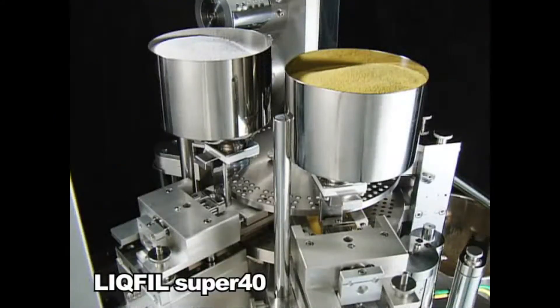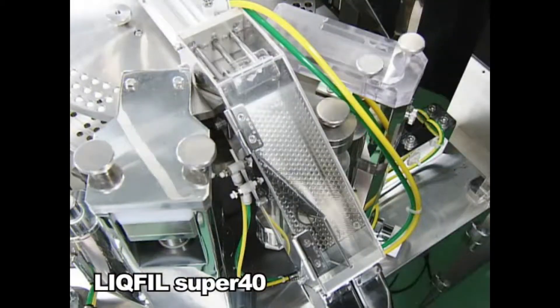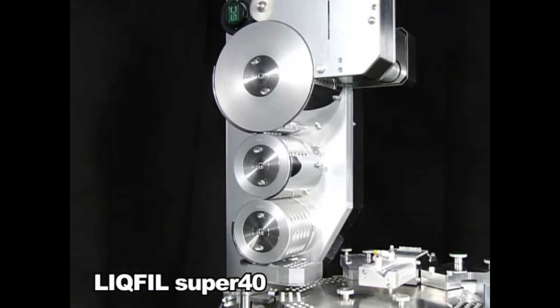The LIQFIL super40 fills capsules with a variety of pharmaceutical dosages, including liquid, granules, tablets and powder.